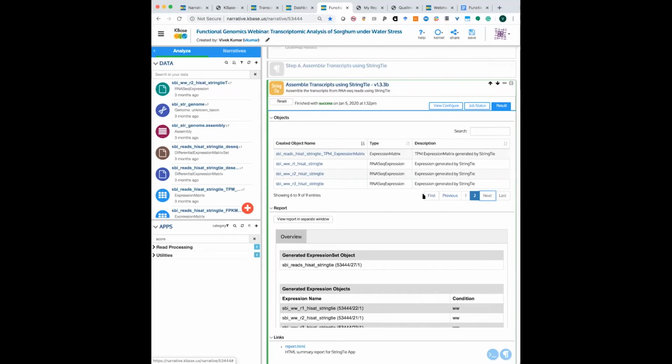For those who are somewhat new to the RNA-Seq field, you'll often find in the literature things like FPKM or TPM. Sometimes you may also find RPKM. FPKM is what was traditionally used. It was very popular in the context of the original Tuxedo pipeline for TopHat and Cufflinks.